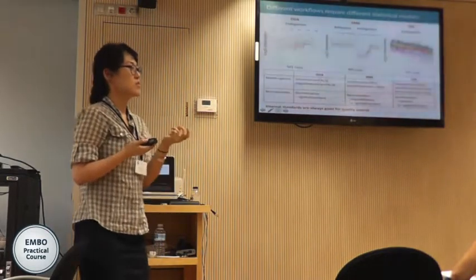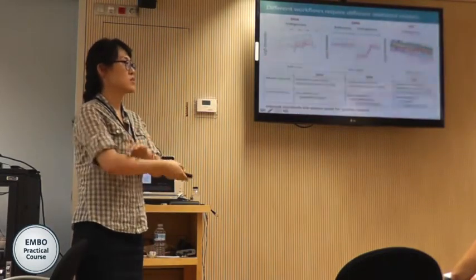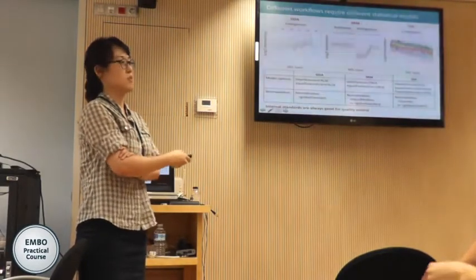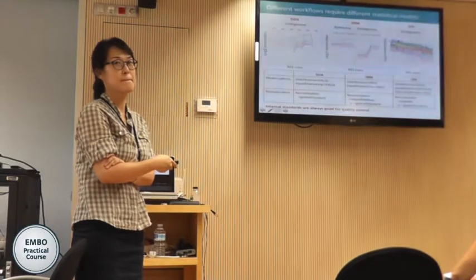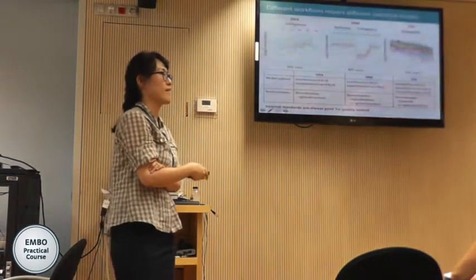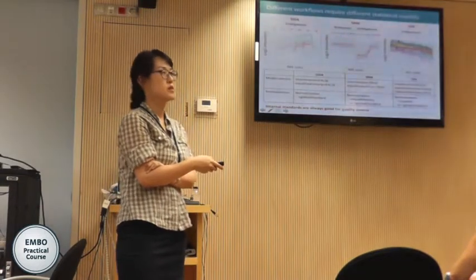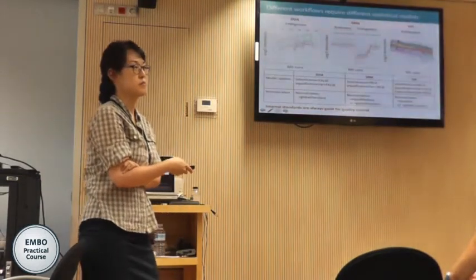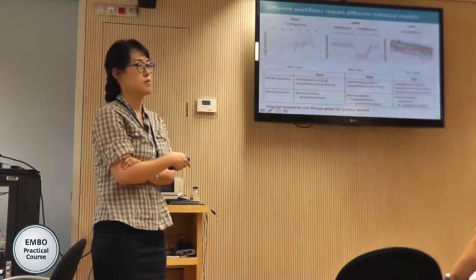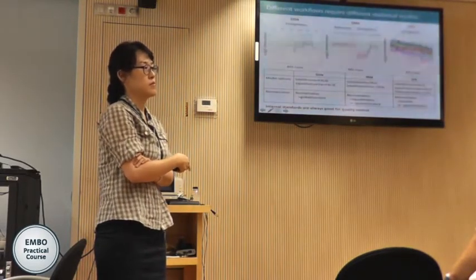What is the meaning of the interference terms? Can you repeat the question? How come for the DIA type of experiment, one would assume that the interference is false? Oh, okay. So it doesn't mean that there is no interference. It's more the interpretation of interference. When we say interference is true, you assume that it's systematic, meaning that if you repeat the analysis, you will see the same interference.